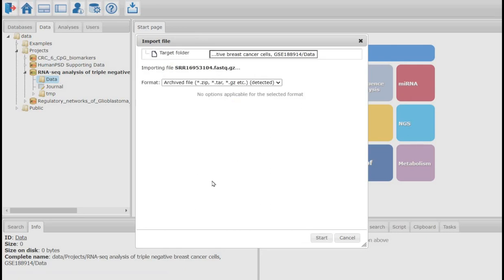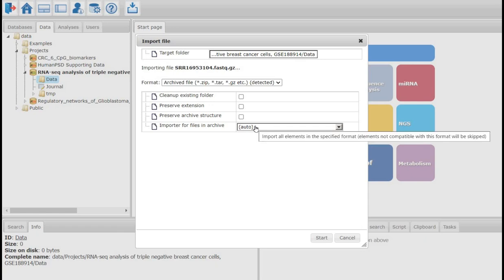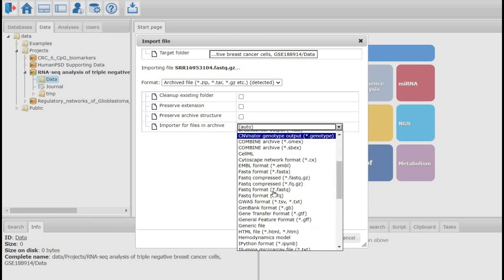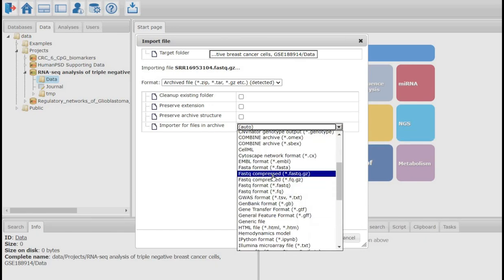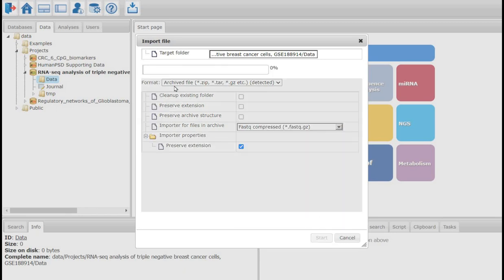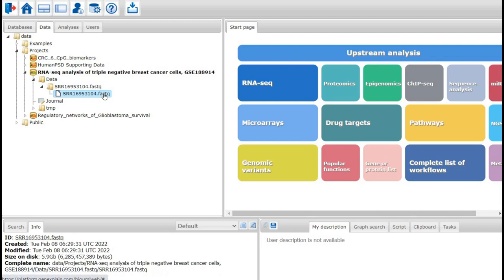Once the upload is finished, the importer detects the type of data, or it can also be selected from the drop-down menu. In this case, we select the importer of files as fastaq.gz and press Start. The FASTAQ file is now getting imported into my project. It again takes a couple of minutes to finish this entire process. My FASTAQ file is now imported into my project. I will similarly import all other five samples into my project.